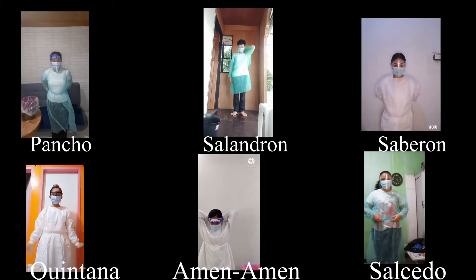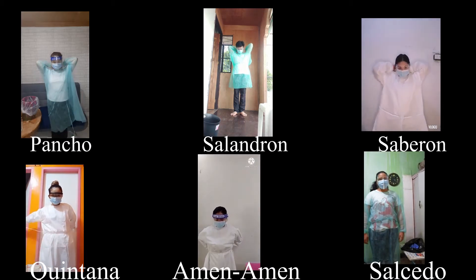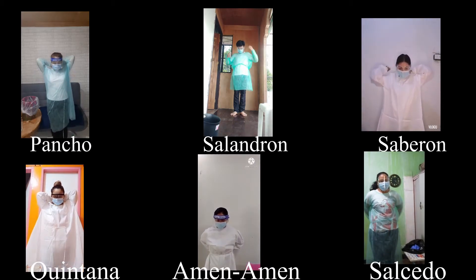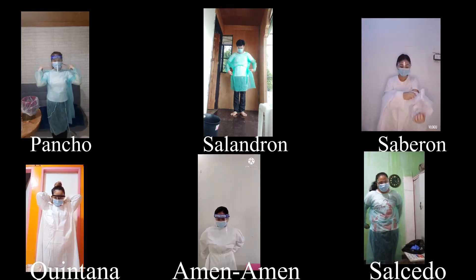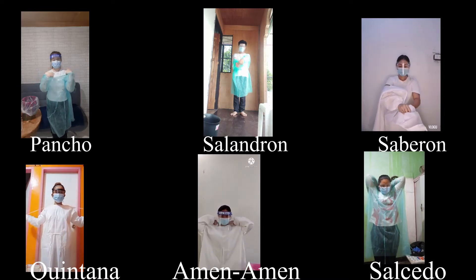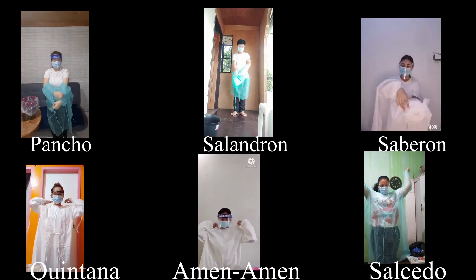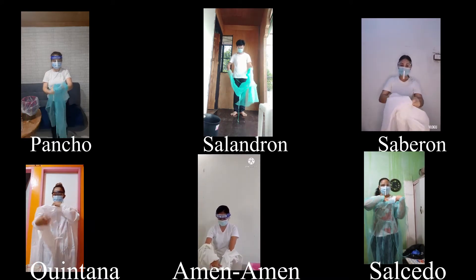Next, remove your gown. Untie all ties or unsnap all snaps. Some gown ties can be broken rather than untied. In that instance, break the ties gently, avoiding a forceful movement. Reach up to the shoulders and carefully pull or roll the gown down and away from the body.